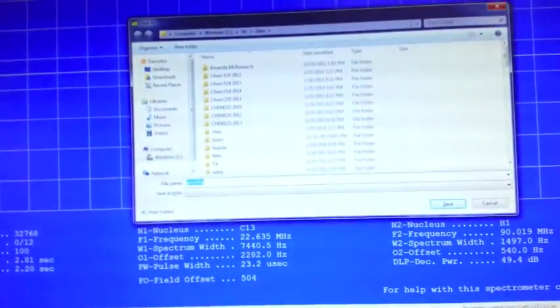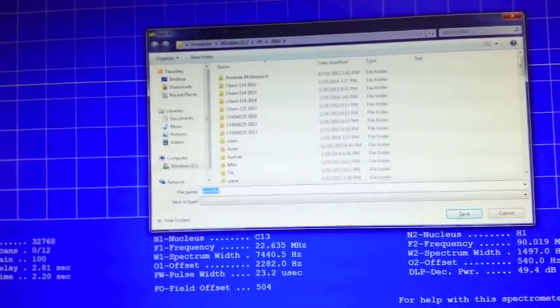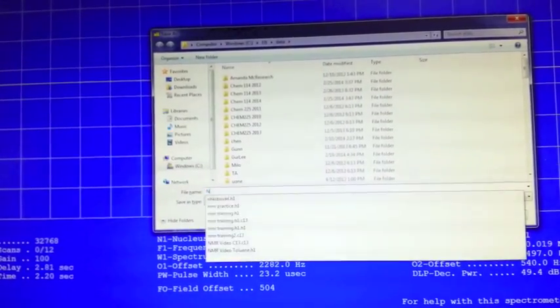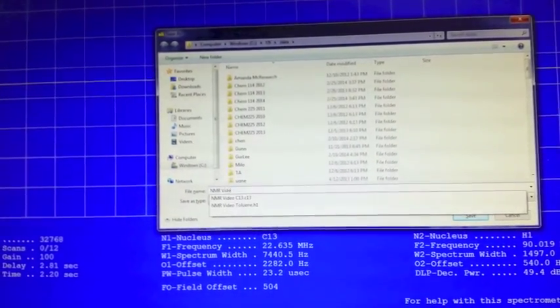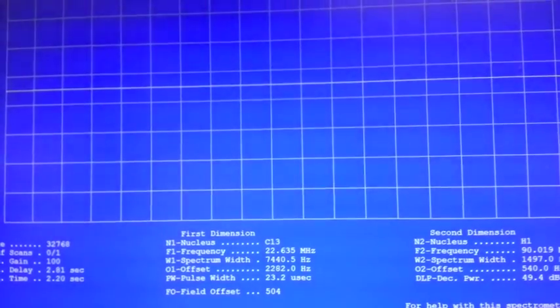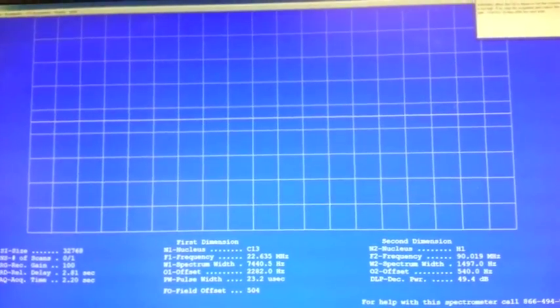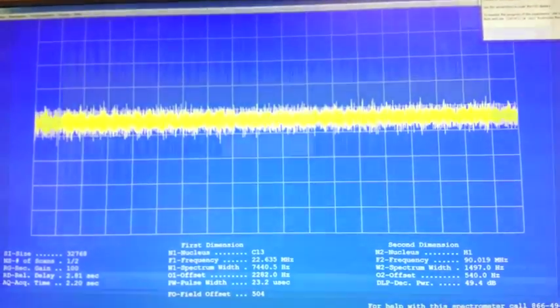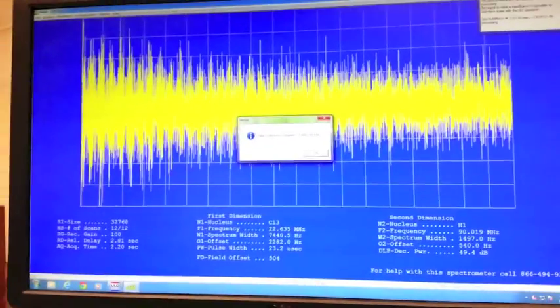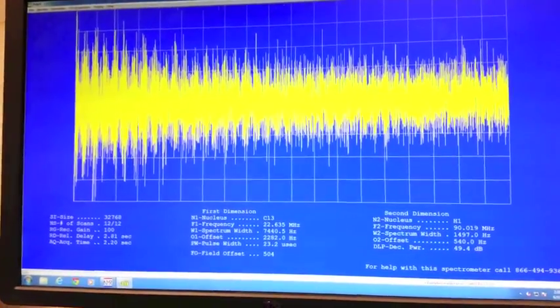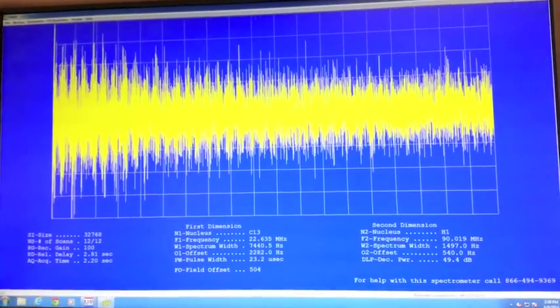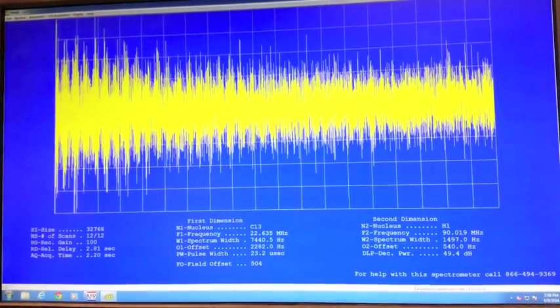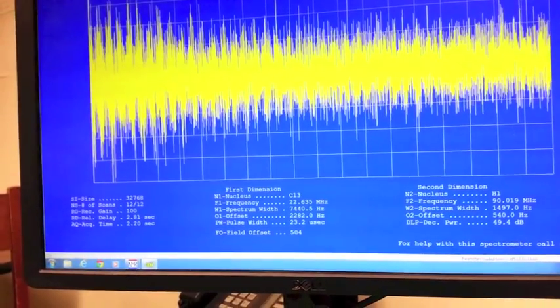This box will pop up and you want to name it something that you'll remember. Once your scans are complete, a box will pop up telling you that data collection is complete and you can hit enter. The next thing you want to do is switch into NUTS. You can do that two ways: either hit alt tab or click on the icon down here at the bottom of the screen.